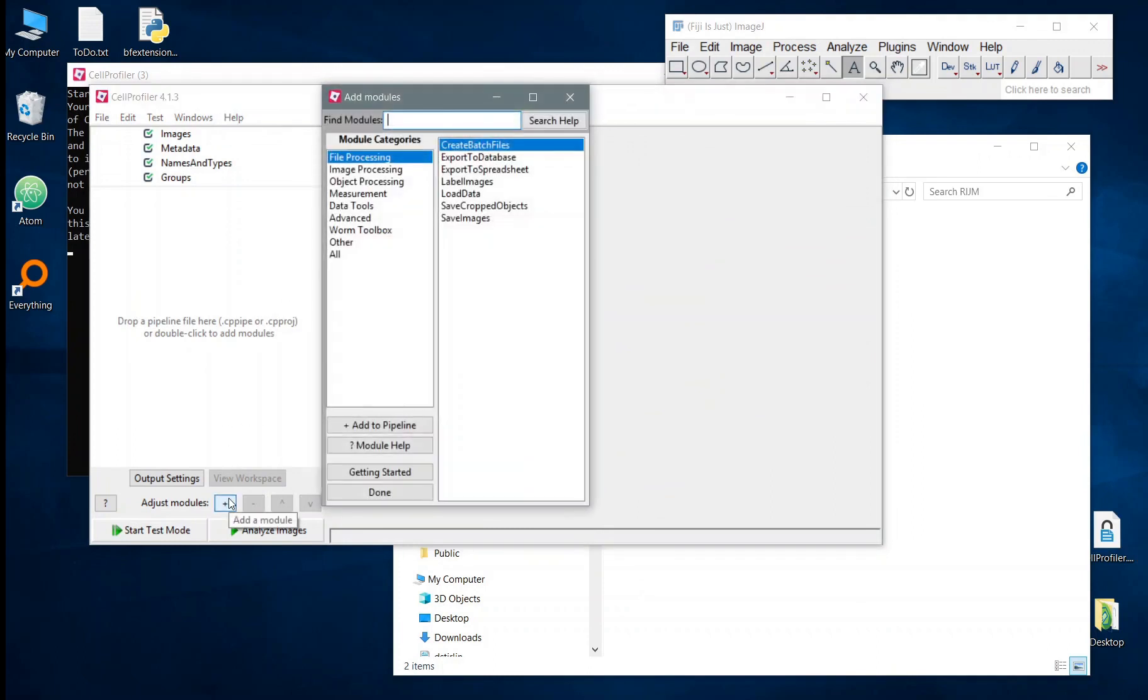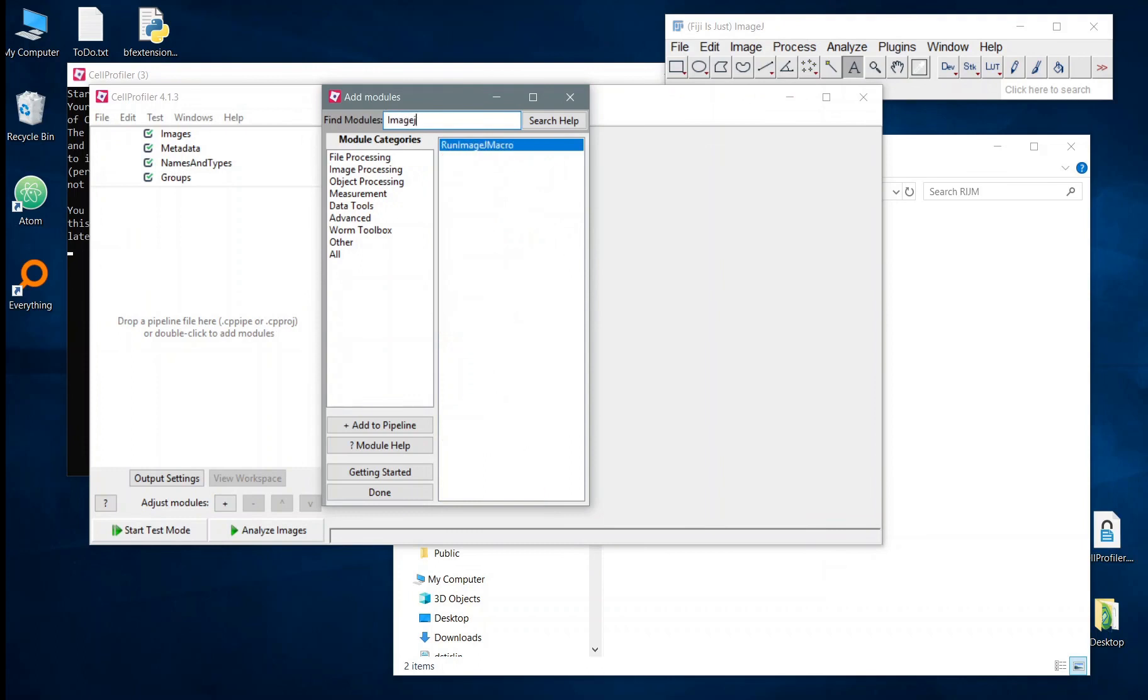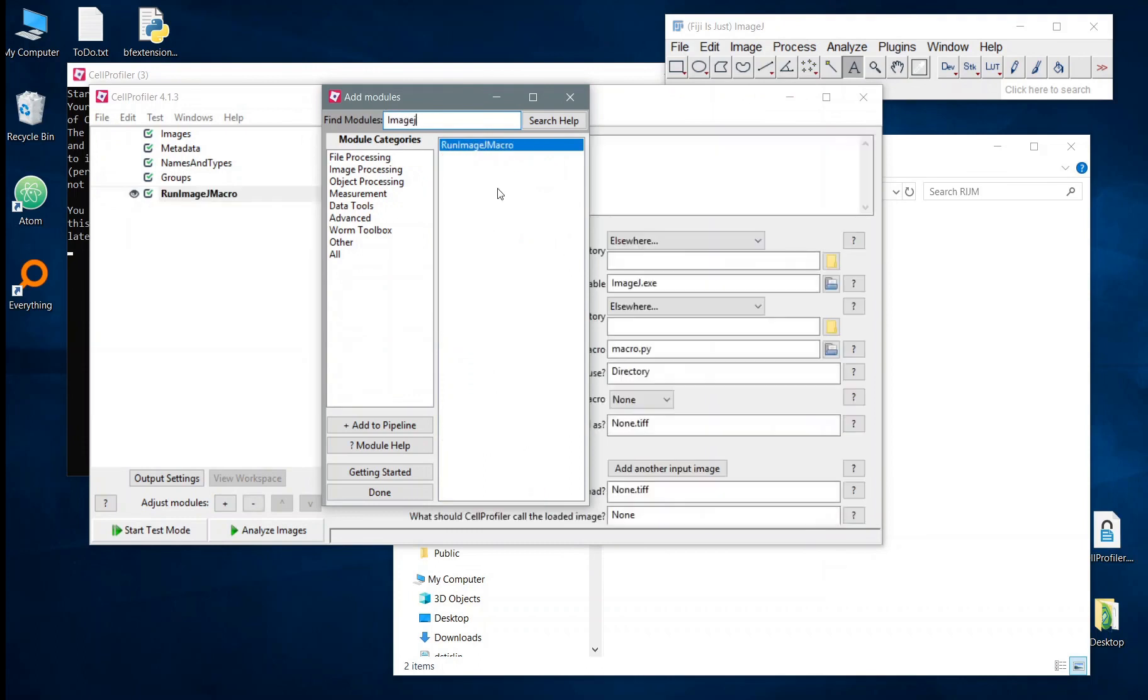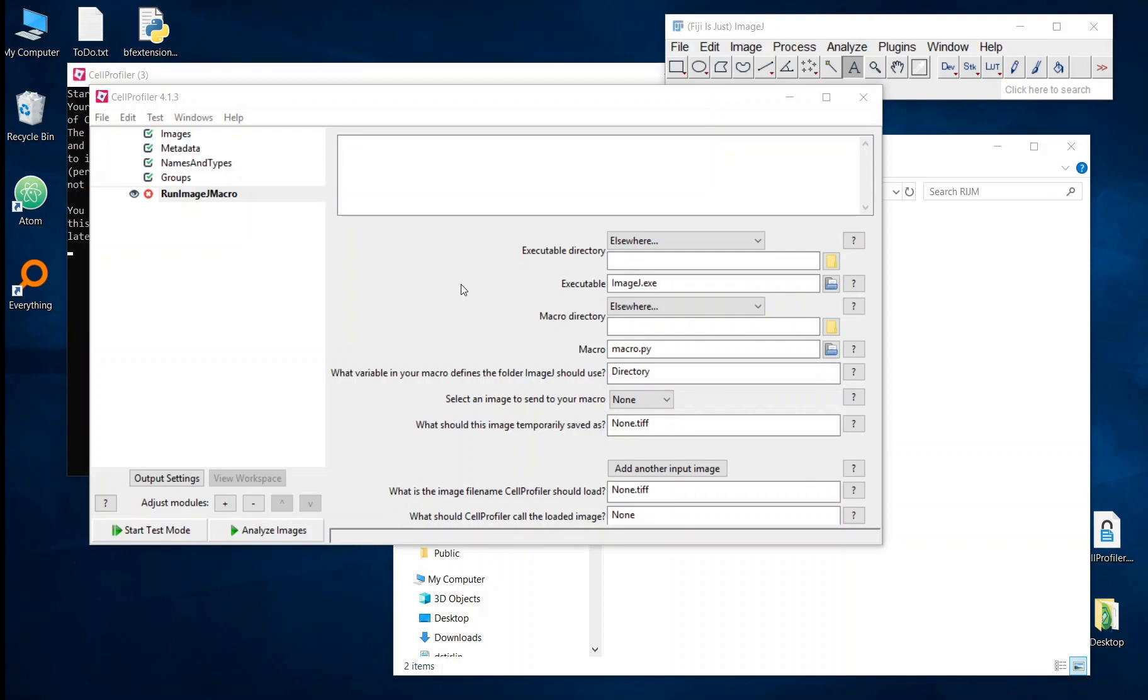This module has been introduced to allow users to link CellProfiler to ImageJ. Effectively what this module does is it will allow a CellProfiler user to create a temporary folder during the run, export an image or send images into that folder and then execute an ImageJ macro on that folder. Once the macro completes, CellProfiler can then import a resulting image produced by that macro.